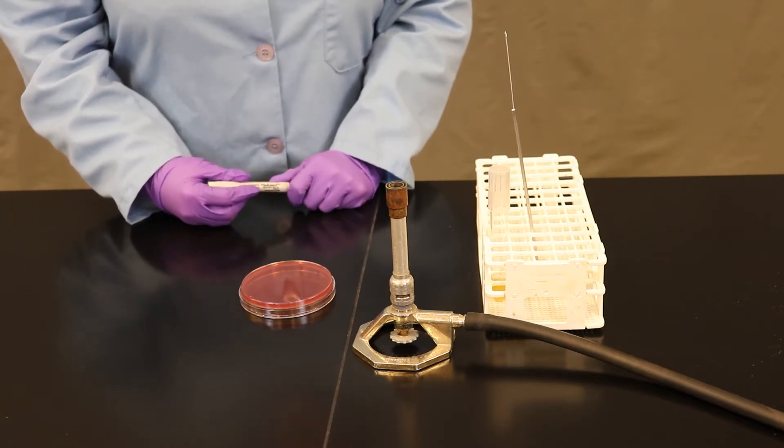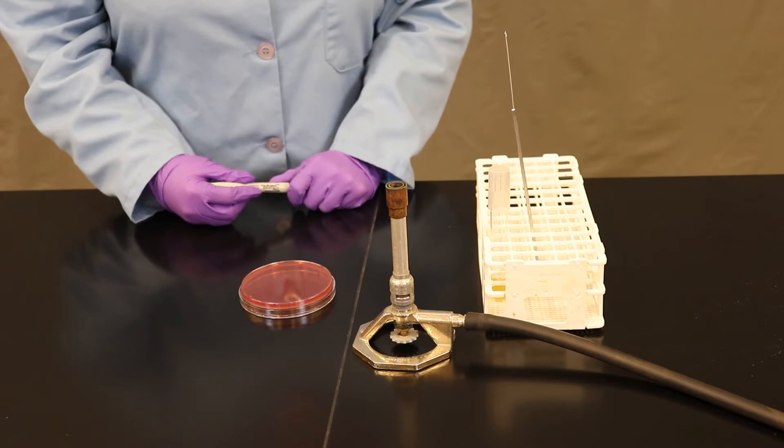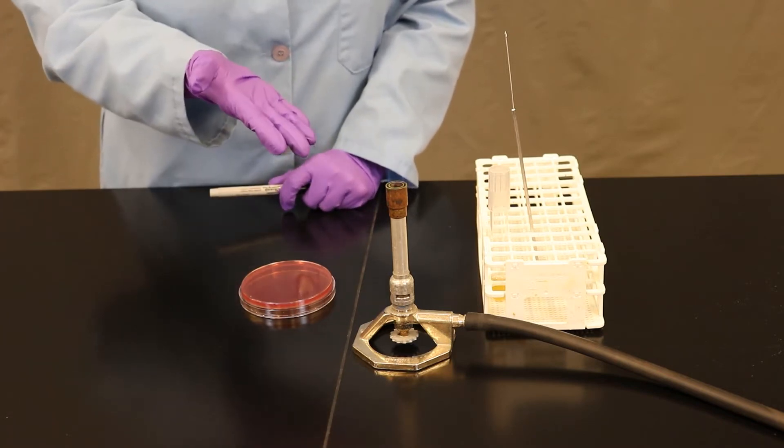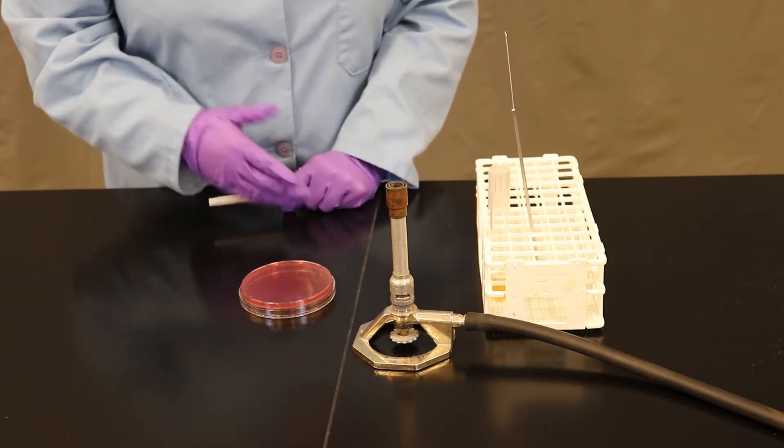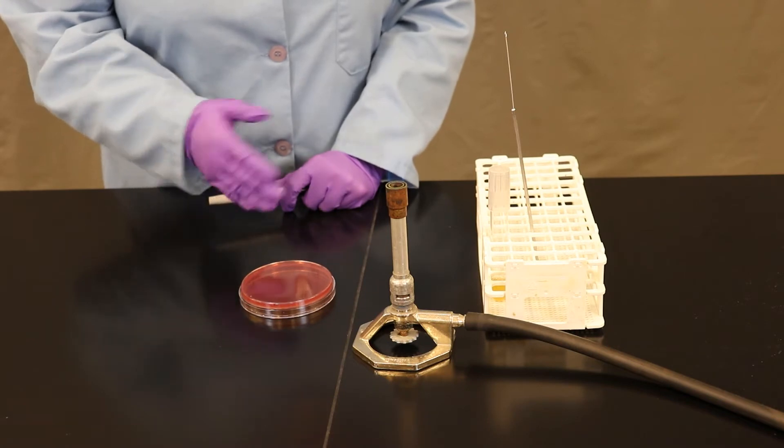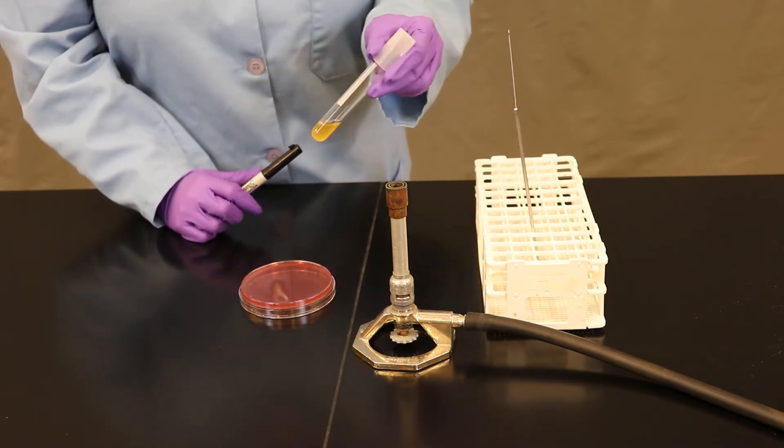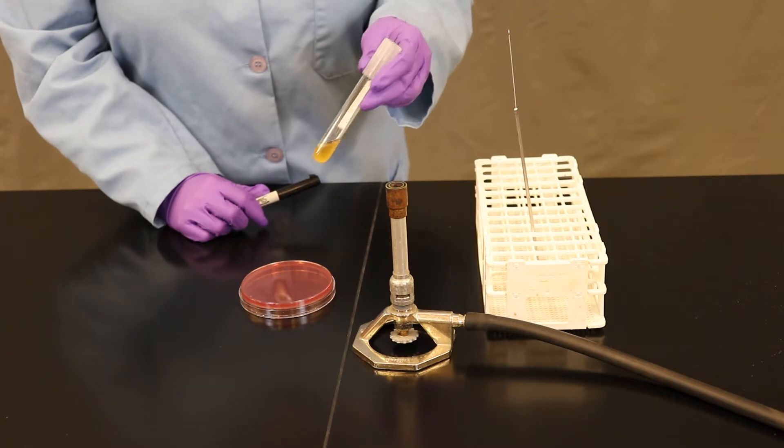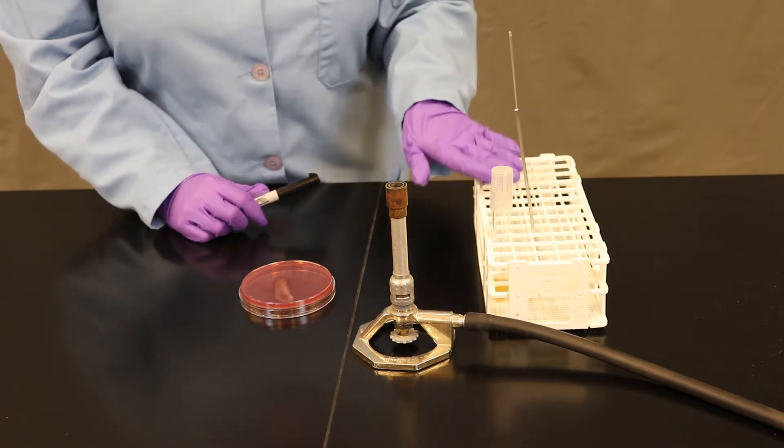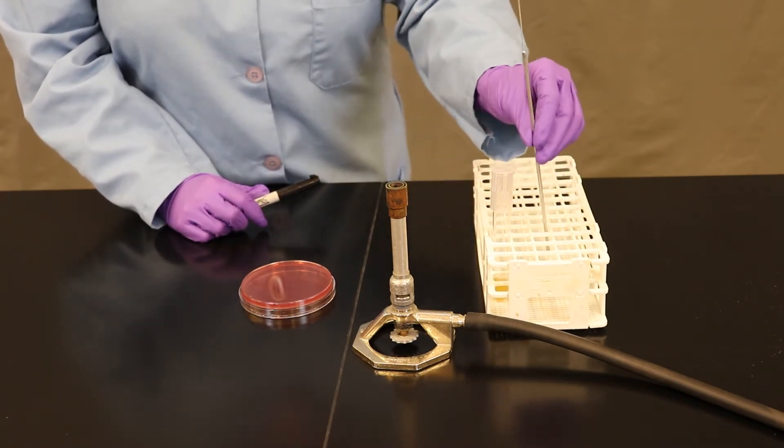Before you begin, you want to make sure you have all your supplies ready to go. We have our Bunsen burner lit and ready, a petri plate that we're going to inoculate. We're going to work today with a mixed culture of bacteria in a broth, a rack, and our inoculating loop.